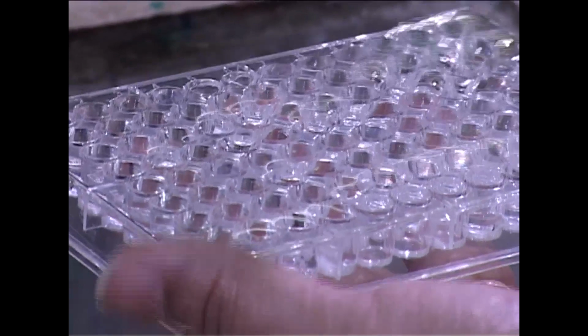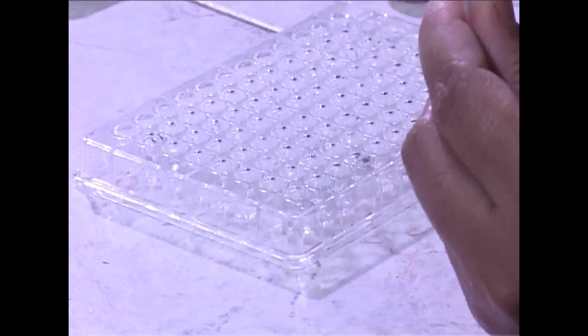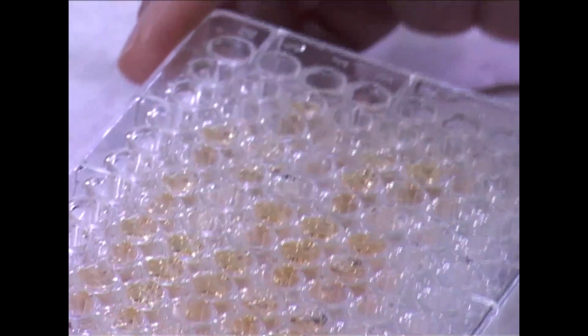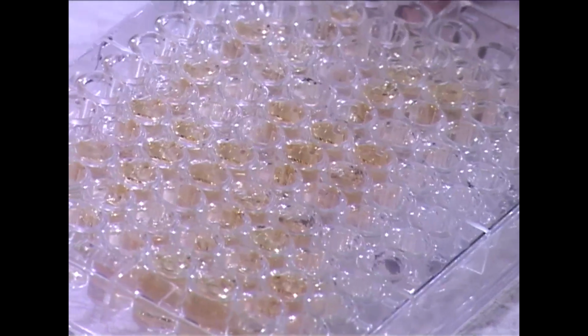Then after washing, we will add a secondary antibody tagged with an enzyme. Then again after incubation and washing, we will add the substrate. Now remember one thing, in competitive ELISA, less coloration means more antigen present in the sample.